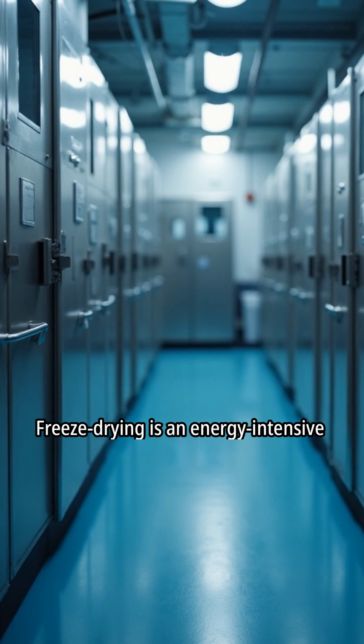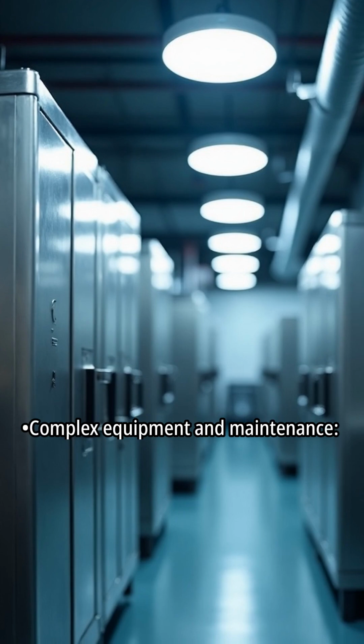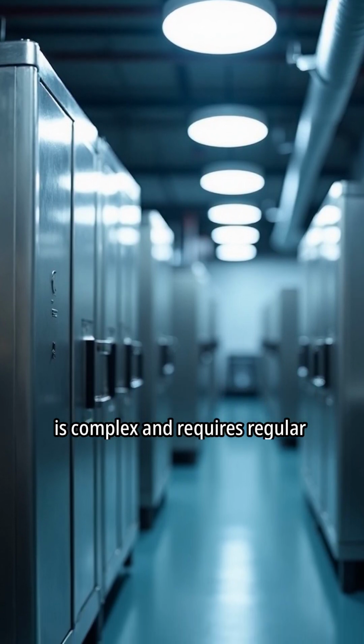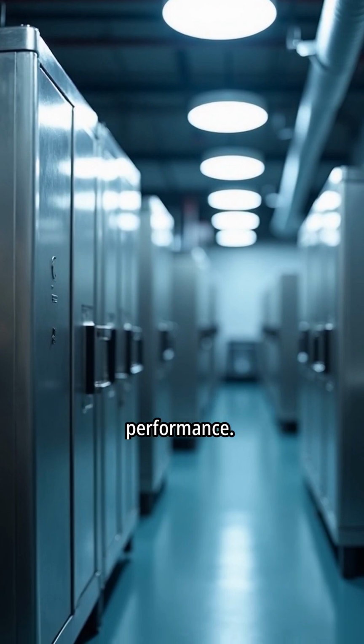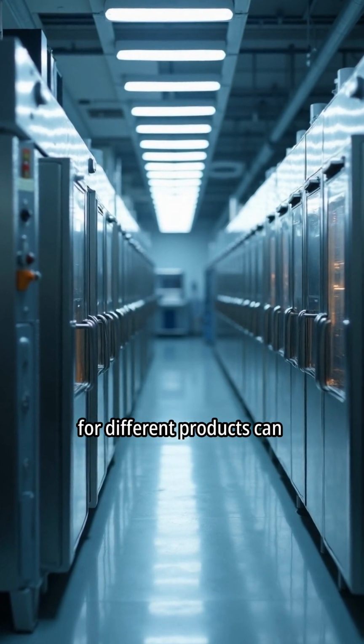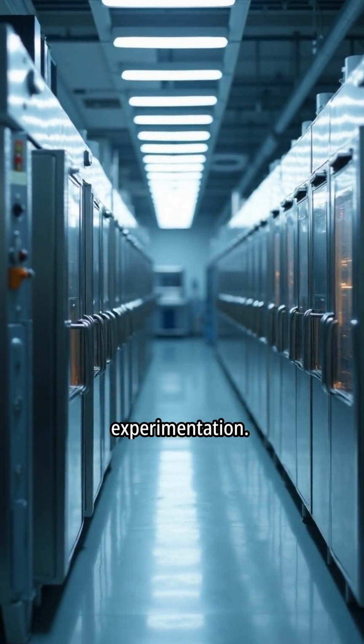Freeze drying is an energy-intensive process that can be costly and environmentally impactful. Complex equipment and maintenance. The equipment used in freeze drying is complex and requires regular maintenance to ensure optimal performance. Process optimization. Optimizing the freeze drying process for different products can be challenging and requires thorough understanding and experimentation.